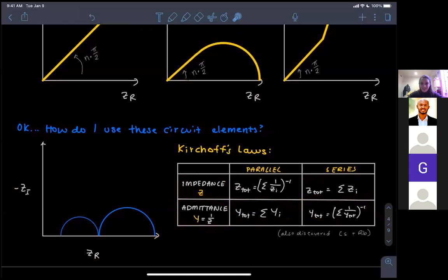Continuing on. So what I'm going to do now for you is essentially bring you through some of the common equivalent circuit models that are maybe used more often than others as a way for you to get familiarity. So I would say the most common one, and the one that actually creates the semicircles here, is the RC circuit. I know I've been alluding to it the whole time, so let's finally get there.